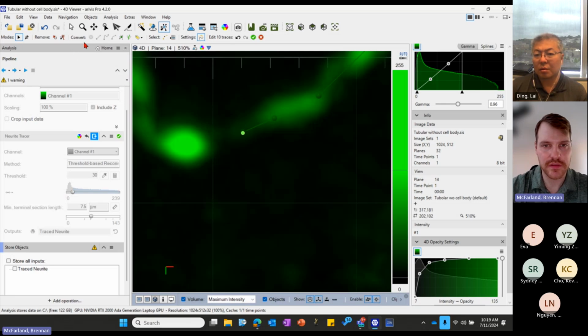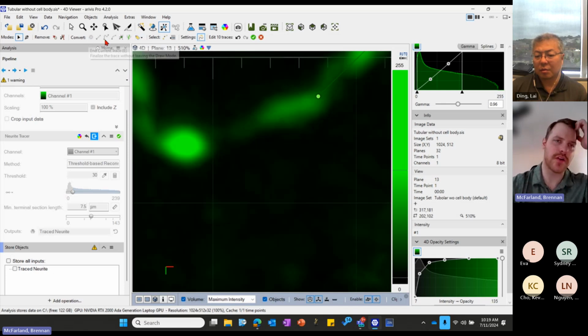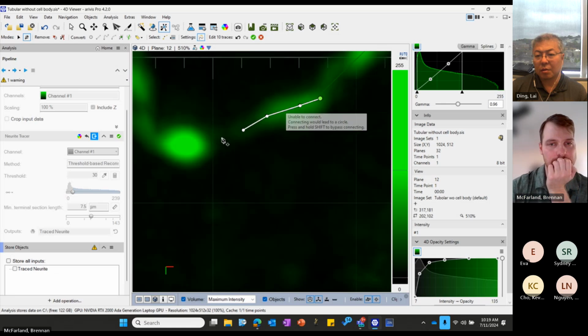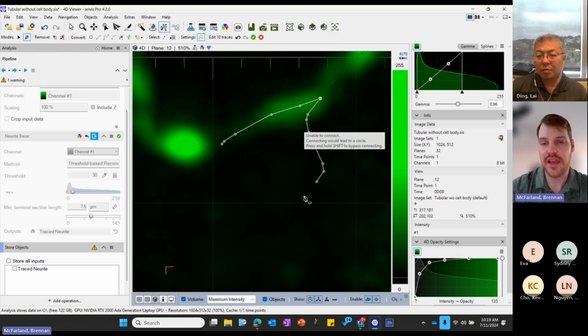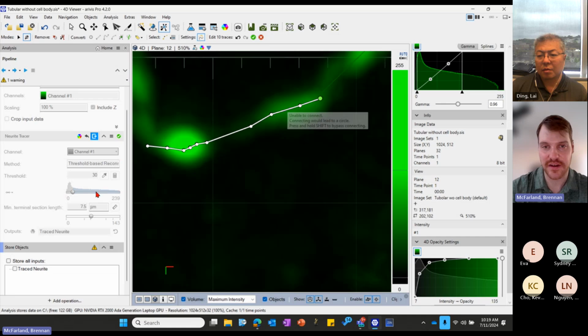The entire branch. And then there's also a few other options here. Depending on if you are doing this automatic tracing, then go and do this. You can see that as I'm hitting this draw button, and then I'm starting with whichever node I want to build off of. And you can see it's snapping, right? It's not a direct straight shot. I'm trying to mess it up a little bit.